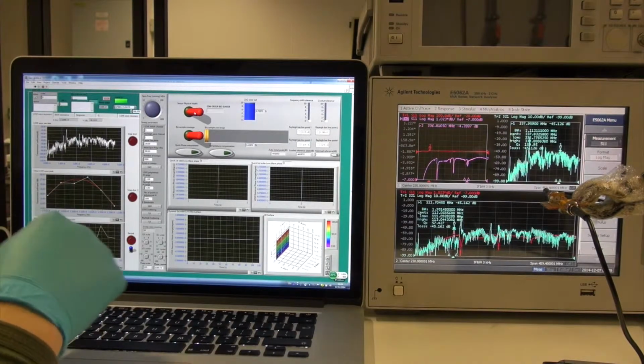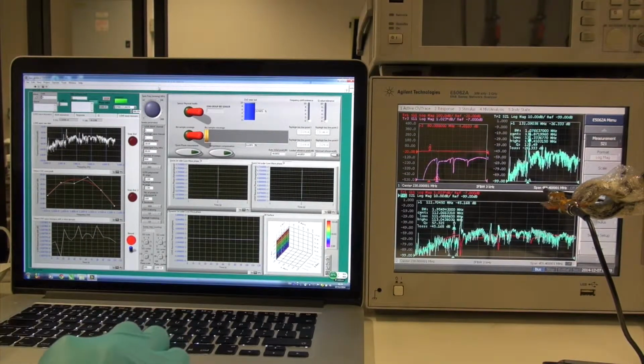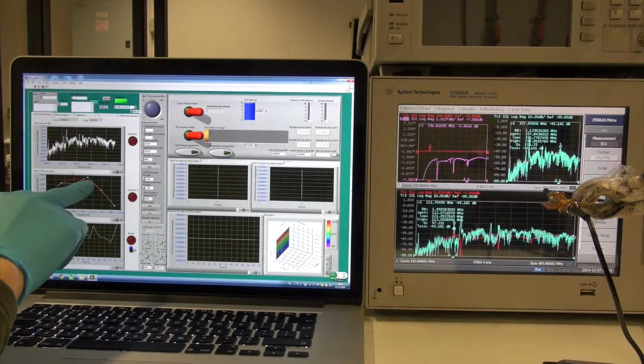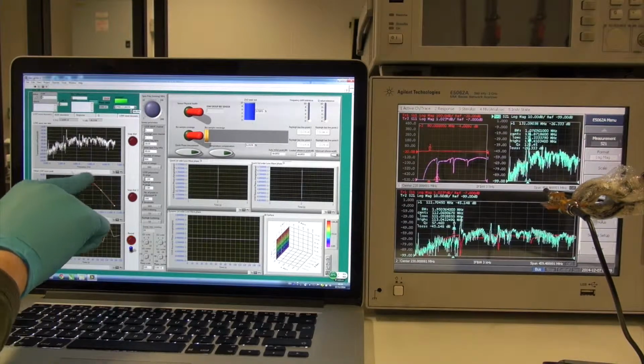Now let me give a very brief introduction of the user interface. Here, in this section, it's the data acquisition window, where we can monitor the data acquisition, and it also automatically does the data fitting. You can see here's the data fitting. We use a mathematical method, the polynomial data fitting method, to automatically analyze the condition at the tip of the resonance peak. You can see the red line is automatically simulating the resonance peak.